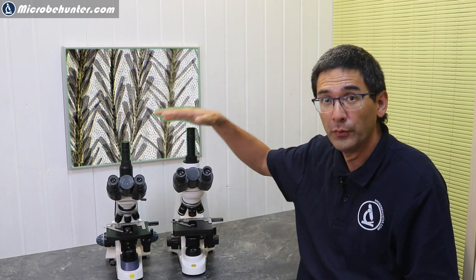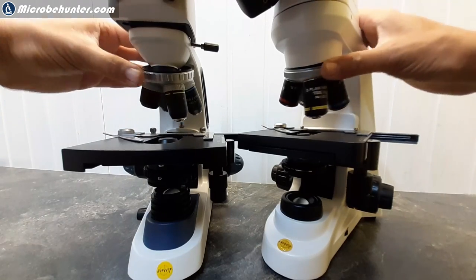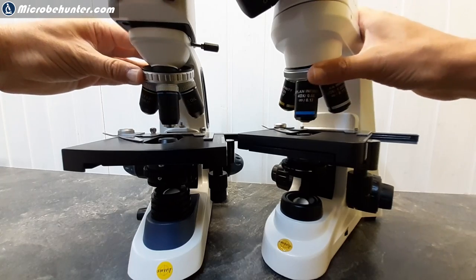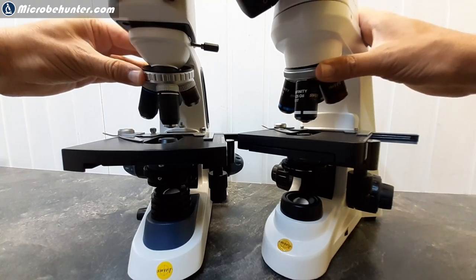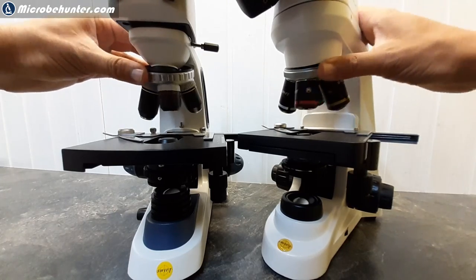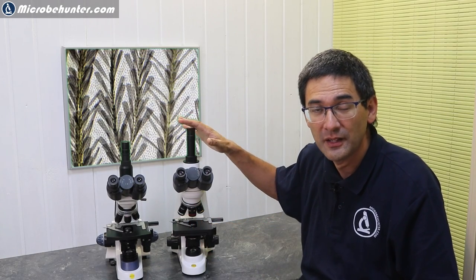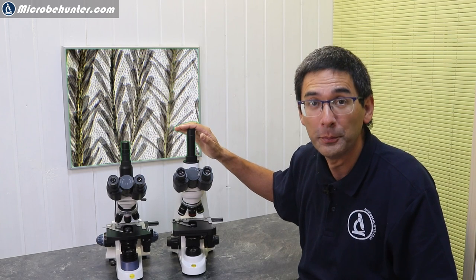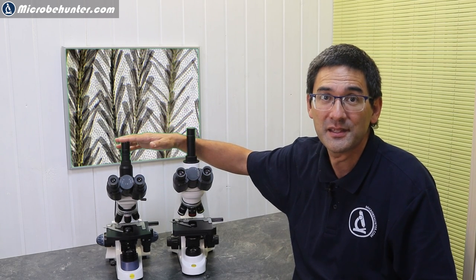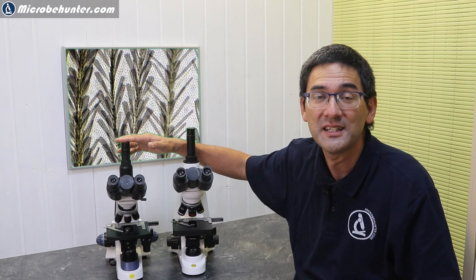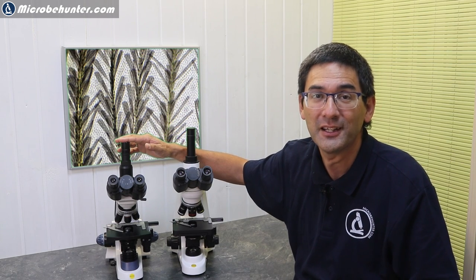Generally both microscopes are quite similar in the sense that they have the same magnifications—both of them have 4x, 10x, 40x, and a 100x oil immersion objective. But the optical standard is different. This Stellar One has infinity optics and the 380T has the traditional 160 millimeter DIN standard, which is actually quite common.